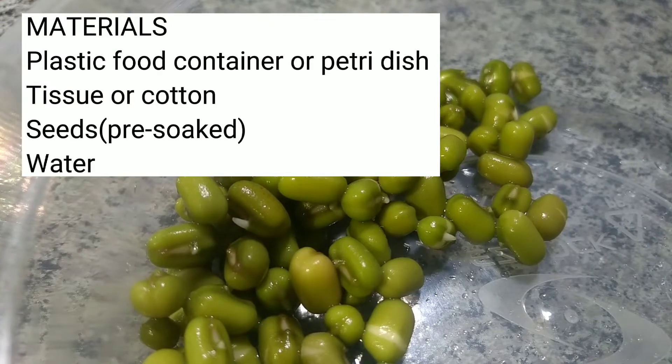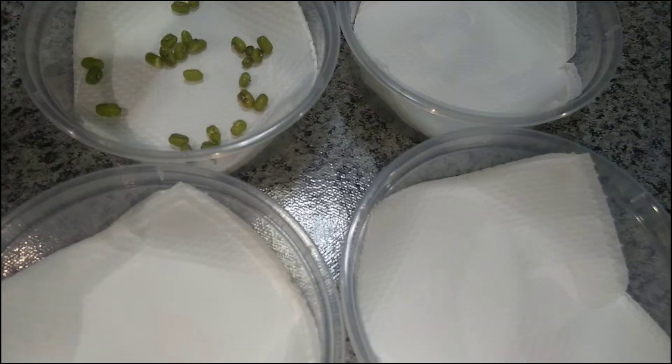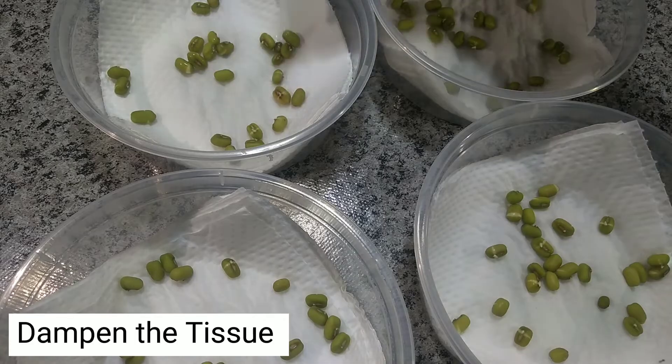Materials. Procedure: Place tissue on the plastic container. Put pre-soaked seeds on top of the tissue.